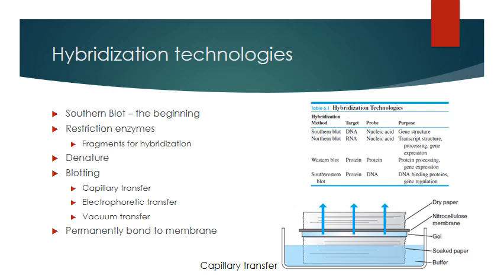These techniques allow us to identify specific sequences that are present after we've resolved a particular section of DNA. That means we resolve something in an agar gel, and okay, we've separated things. How do we know what's there? How do we know if the sequence that we're looking for is there? Well, we use a probe, and those probes are based on hybridization technologies.